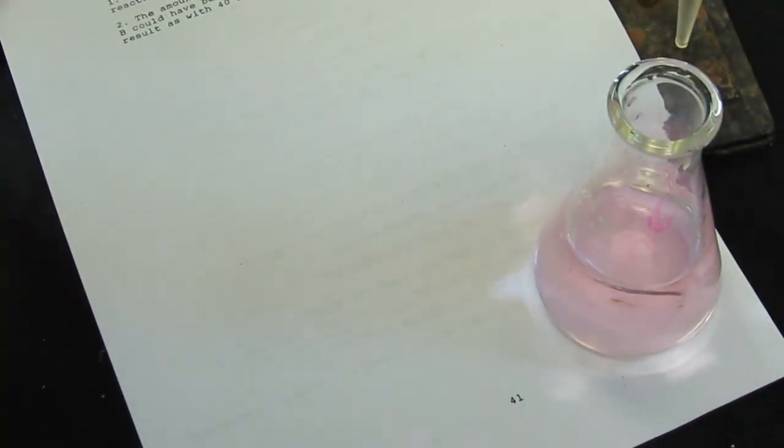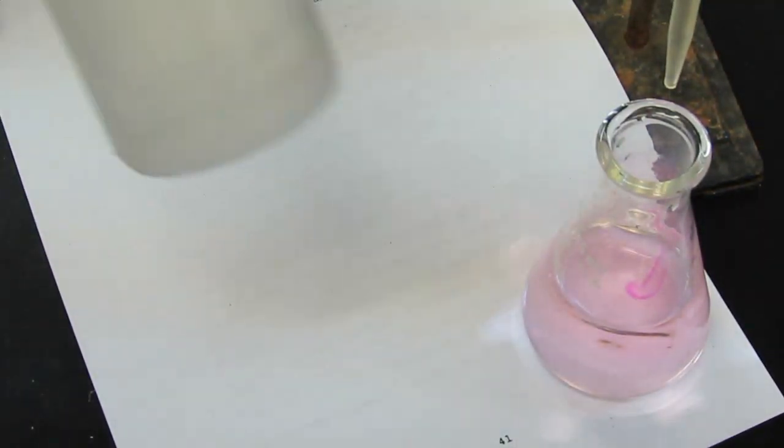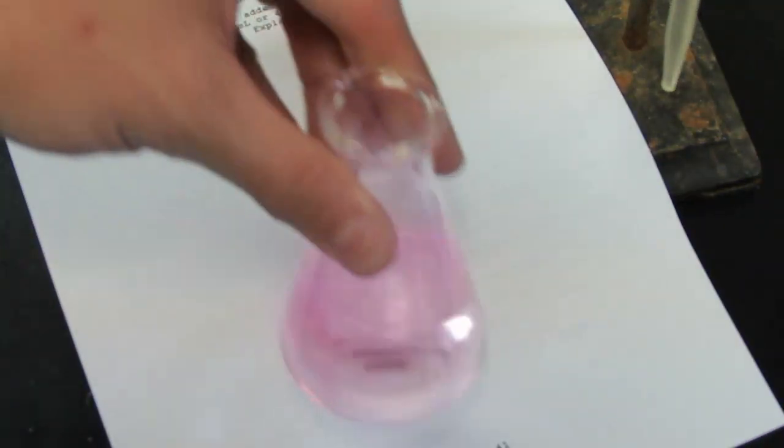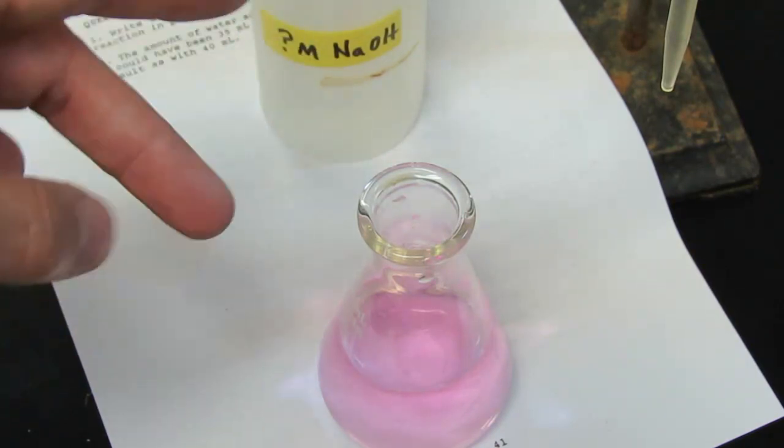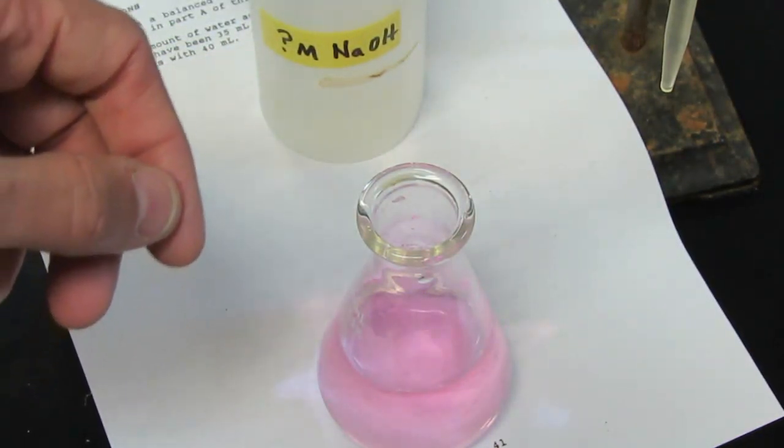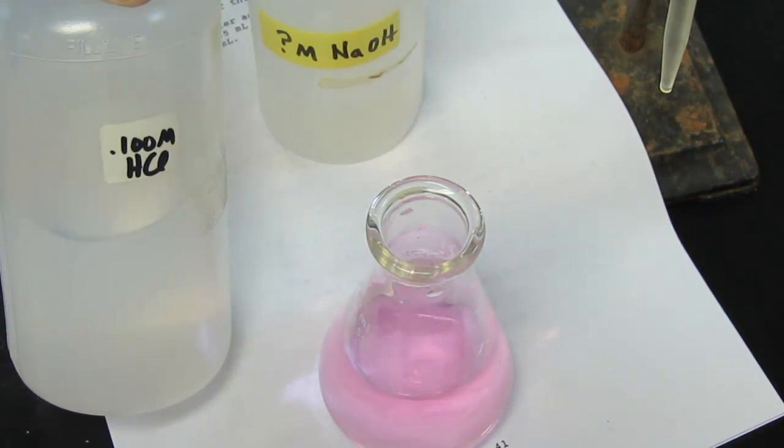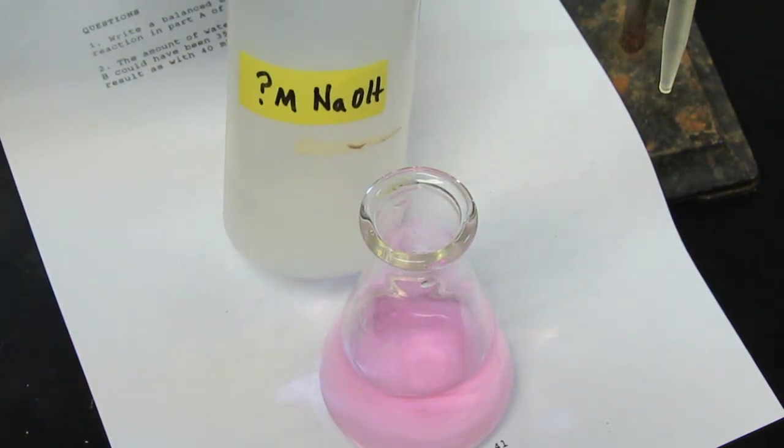So we've finished our titration. You guys know the molarity of the acid. Once again, the acid was 0.100 molar hydrochloric acid. We do not know the molarity of the base. That's the objective in the first part of this experiment - to find the molarity of that base. So you now have enough information to do that. Think about this. You know the initial and final base reading, so you know the volume of base that was required. And you know the initial and final acid volume, so you know the volume of acid that was used and its molarity. With that information, you should be able to calculate the molarity of your sodium hydroxide solution. We call this process standardization.